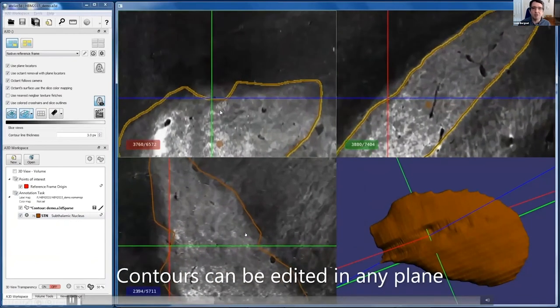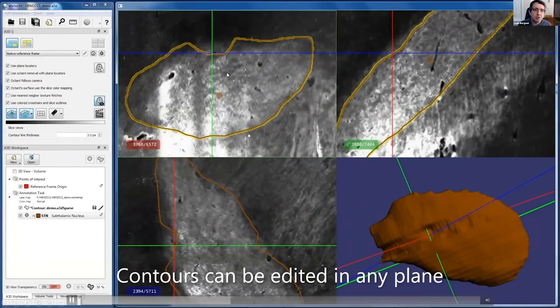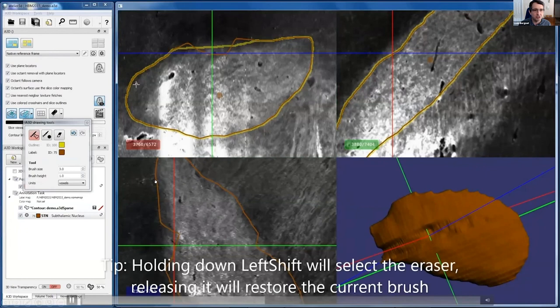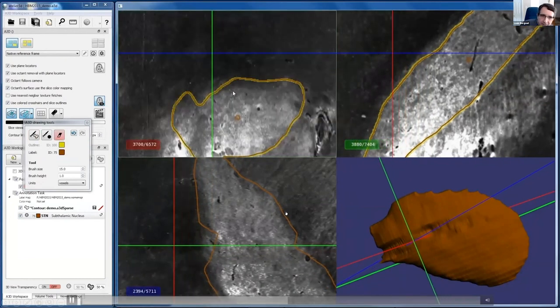One important thing to notice, now we have annotations on multiple axes. You can see that whatever is a drawing in a specific axis appears in transparency as an intersection in the other ones. So you do have 3D visibility. So you can see here every 20 slices, the intersection of those yellow drawings in that axis, and you can see both axes here. So there is that element of visualization that is very important.